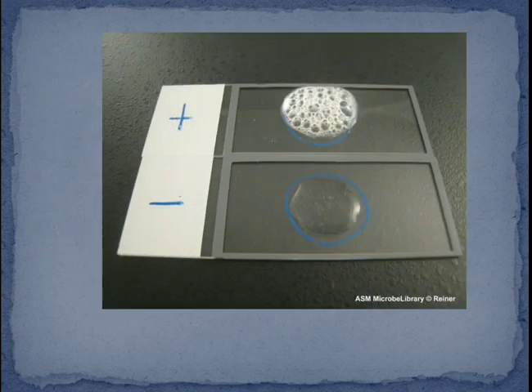Here in the figure we can see positive and negative reaction. In positive slide we can see bubble formation or effervescence. In negative slide no bubbles are formed.